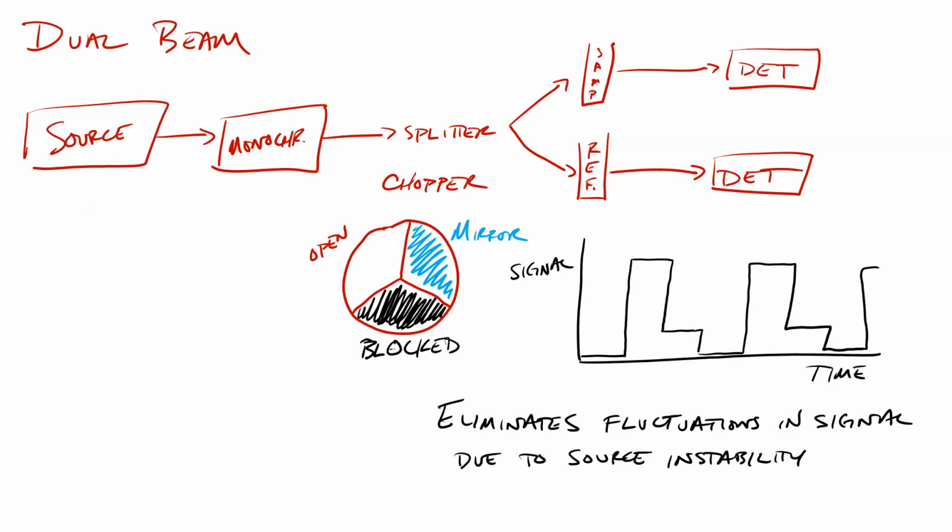These are still sort of the gold standard for research instrumentation. They're very expensive because there's a lot more moving pieces, right? You have to have a chopper. That chopper has to be sort of exactly synced with the computer, so you know at exactly which point that chopper is at each second.